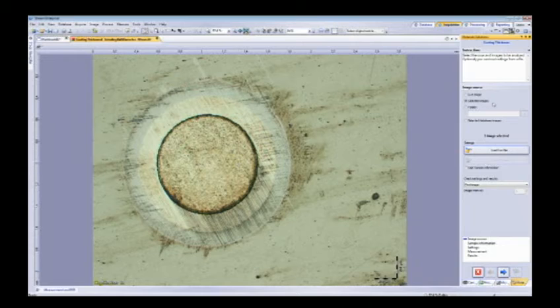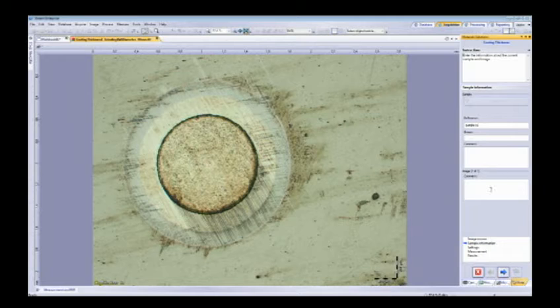Exactly. So all of these solution modules, they work as a workflow, just next kind of buttons. They all give you instructions at the top. We hit next here. We can type in a lot of information for our samples. Customers are usually going to have hundreds of these pictures that they'll want to process through, and this solution module can batch process those. All of our solution modules can do batch processing.